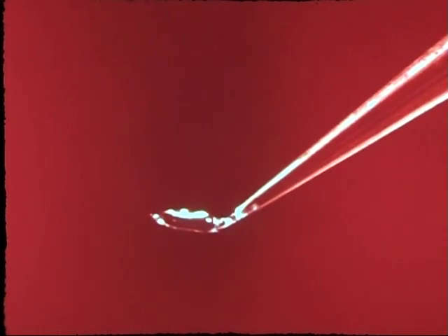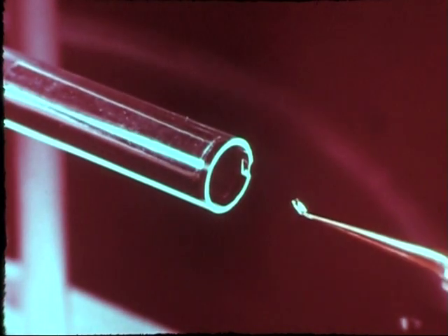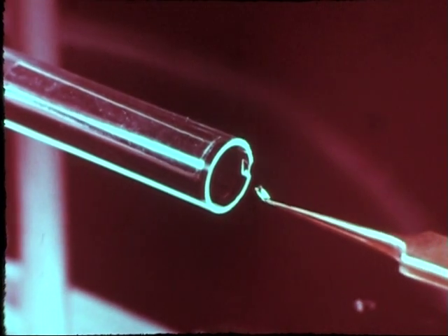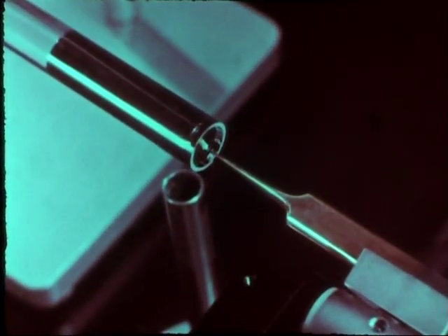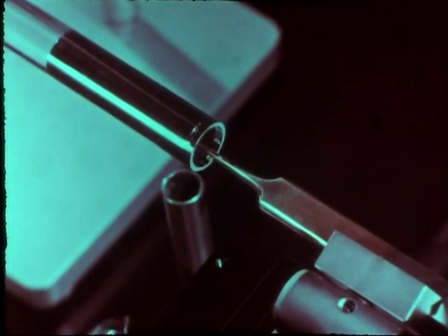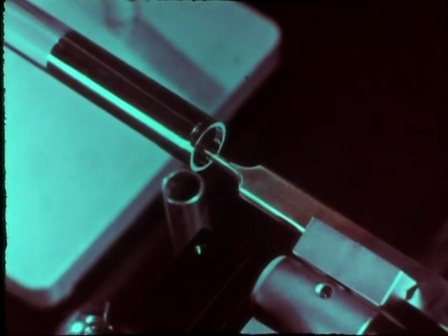The plutonium nitrate solution was allowed to evaporate at room temperature. The sample was heated in a burner oven to convert it into plutonium oxide, the chemical state of the element used in weighing.